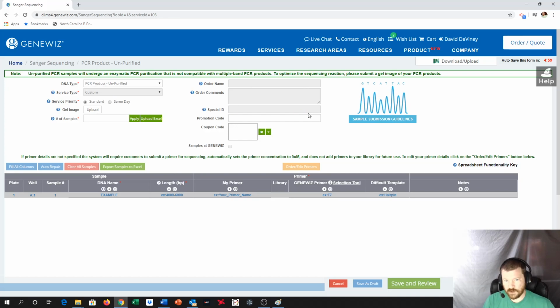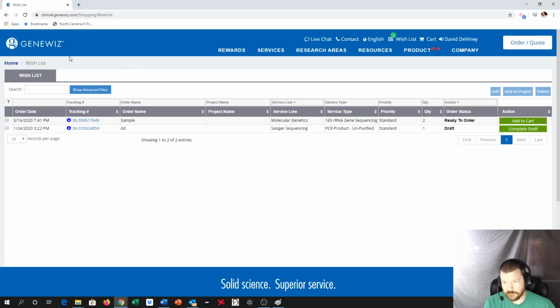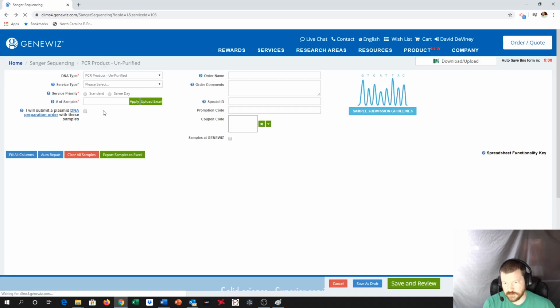And so essentially, this is their order sheet, right? I can show you. Let me show you this first.